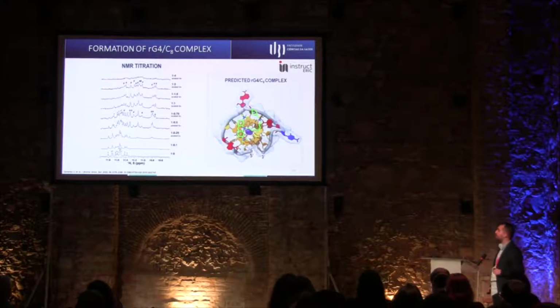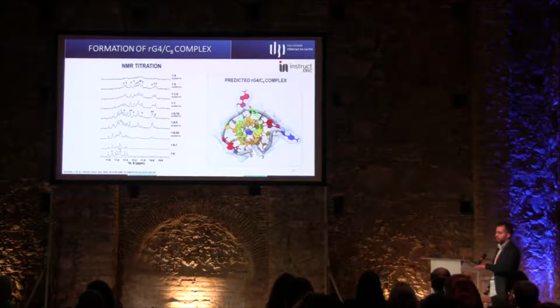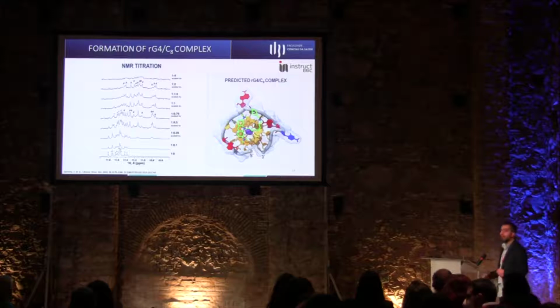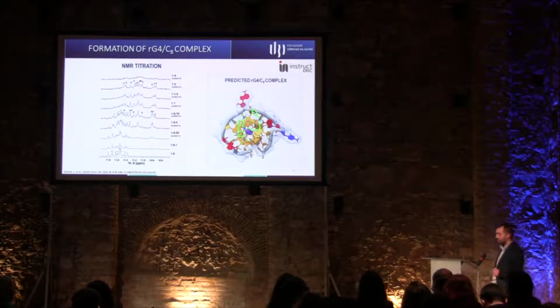Then we performed 1D NMR titrations. We titrated the solution of G-plex with the ligand, and we found that at a ratio of 1 to 0.75 of G-plex to ligand, the complex is totally formed. In this way, we conducted molecular dynamics studies to predict the binding mode of the ligand on the G-plex, and we found that the ligand stacks over the top G-tetrad, establishing mainly stacking interactions.